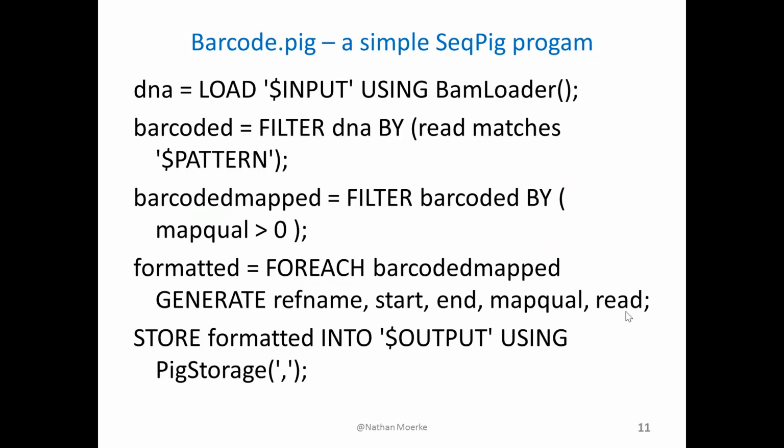What I set out to do was write a very simple SeqPig program that can take a large collection of DNA sequences that have been aligned to a reference genome but might come from different individuals, and fish out all the sequences that contain a particular DNA barcode.